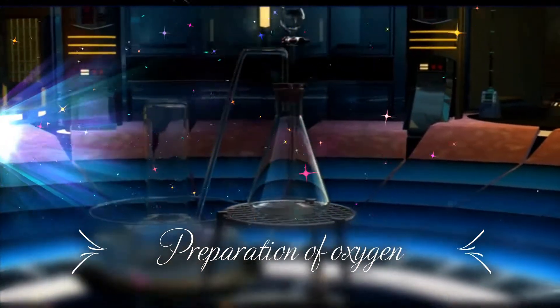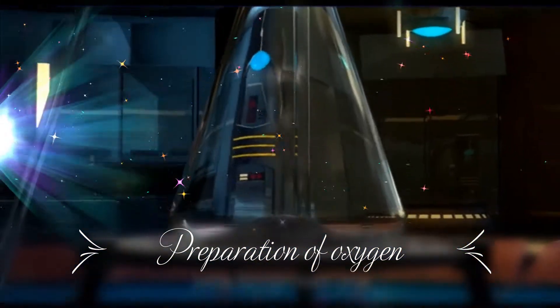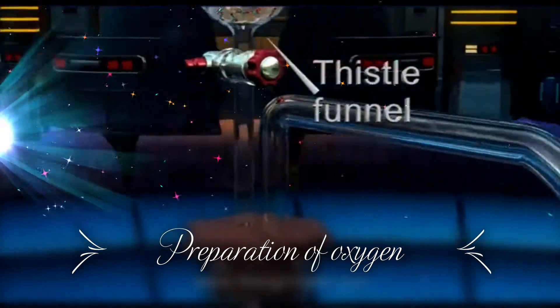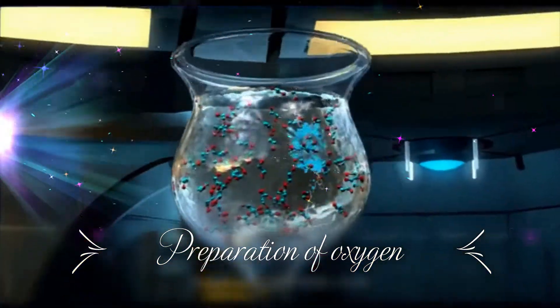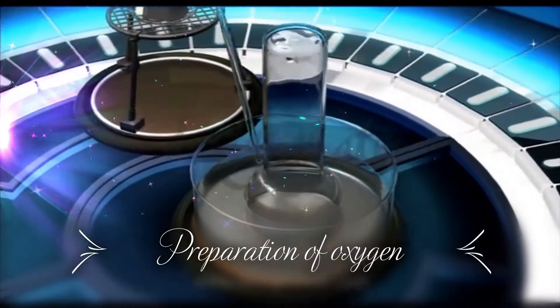The experimental setup has a conical flask containing manganese dioxide, which acts as a catalyst. To this flask, fit a cork through which the tube of the thistle funnel is passed. The thistle funnel has a tap and it is filled with hydrogen peroxide. The other tube leads to an inverted gas jar over a trough of water.